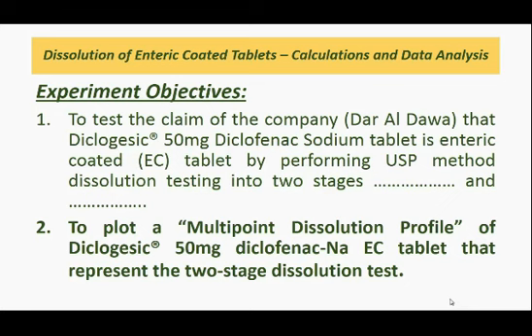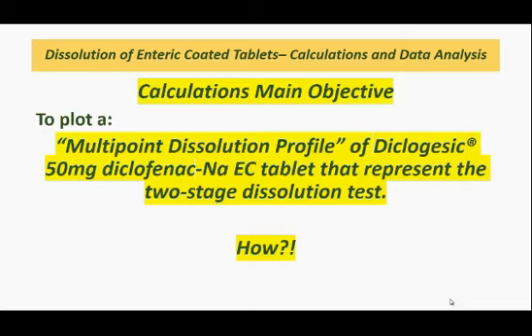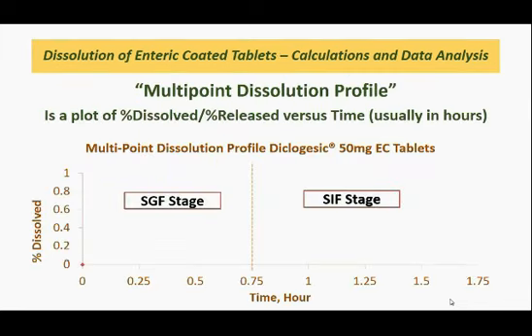And our calculations objective was to plot a multi-point dissolution profile of Diclogesic 50 mg diclofenac sodium enteric coated tablet that represents the two stages of the test.